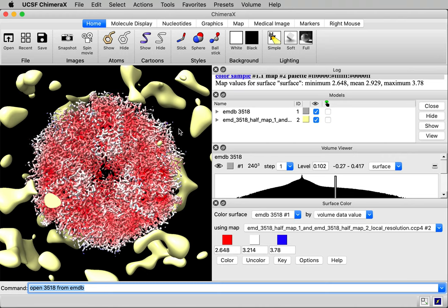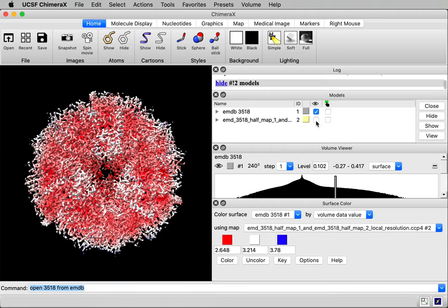Let me hide the yellow local resolution contour surface in the model panel. Okay, first it's colored red at low resolution. I would prefer blue.